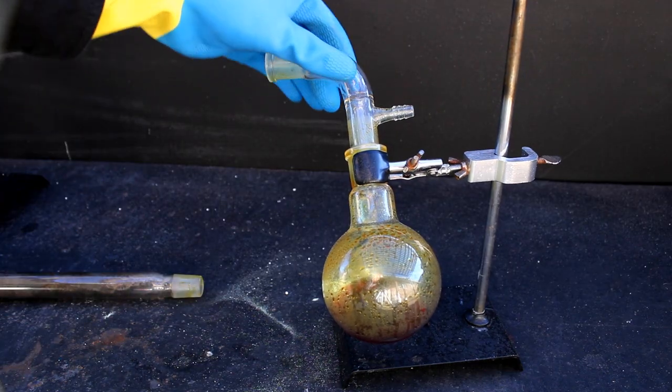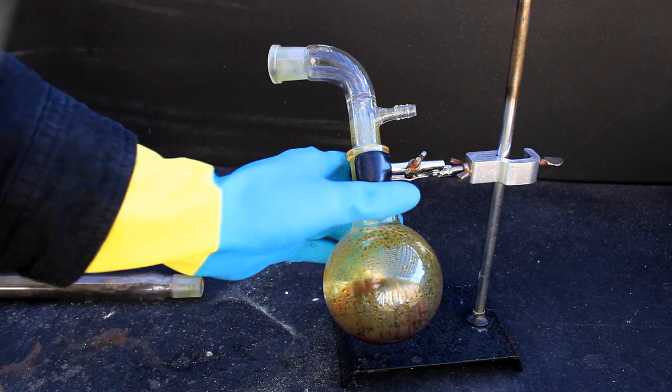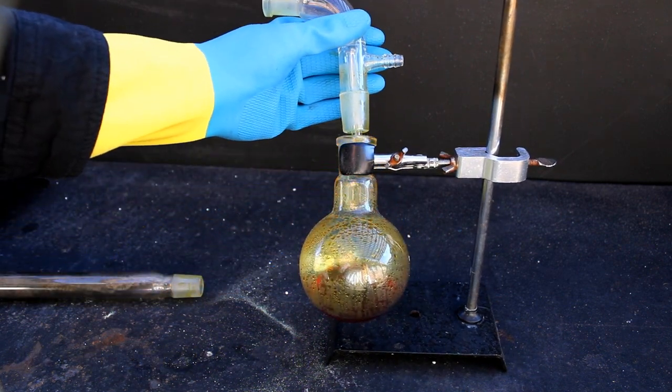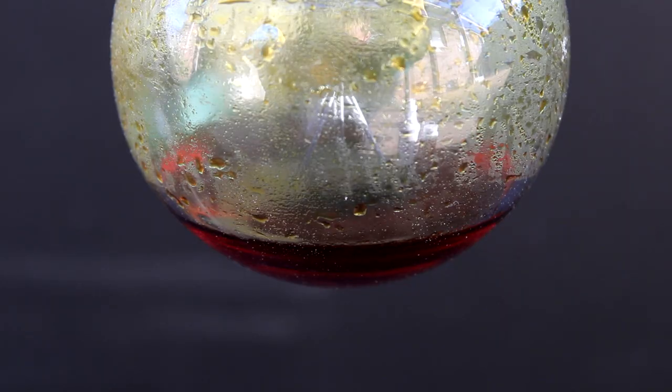After a while, all of the sulfur will have reacted away, leaving the glass tube completely empty. In the receiving flask, you should see a nice red liquid. This is mostly sulfur dichloride based on the color, but some sulfur monochloride is inevitably intermixed with it, along with some sulfur that either came over while the reaction was going or formed when the sulfur chlorides contacted moisture.